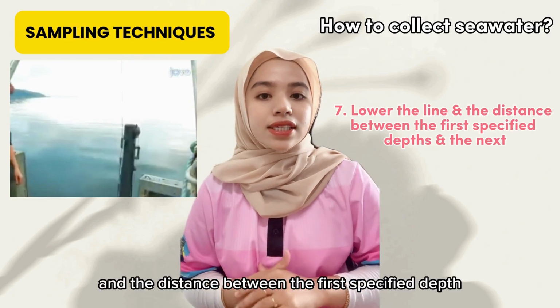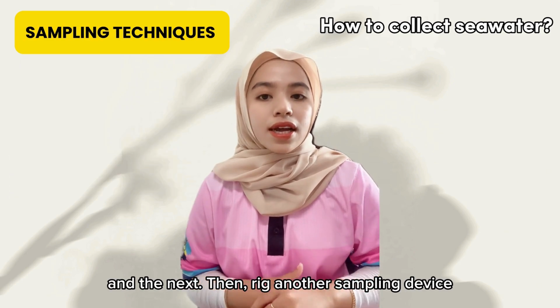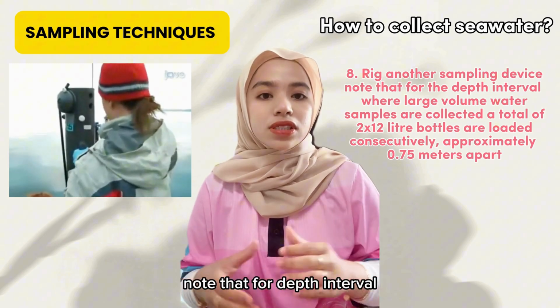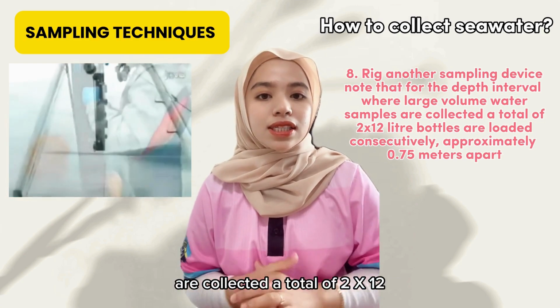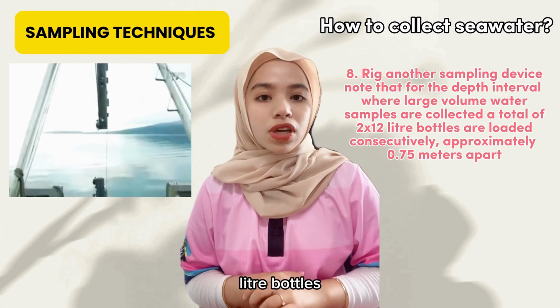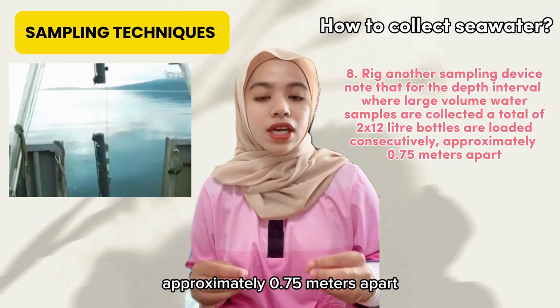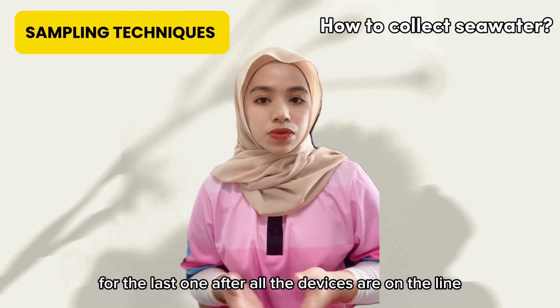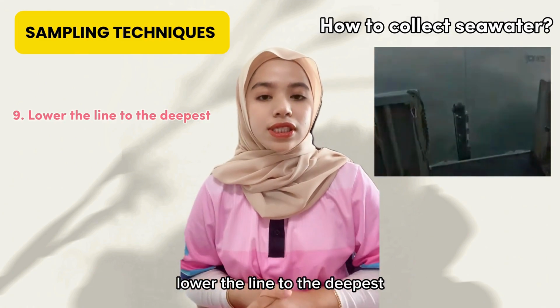Lower the line the distance between the first specified depth and the next. Then, rig another sampling device. Note that for depth intervals where large volume water samples are collected, a total of 2 times 12 liter bottles are loaded consecutively at approximately 0.75 meters apart. For the last one, after all the devices are on the line, lower the line to the deepest depth.